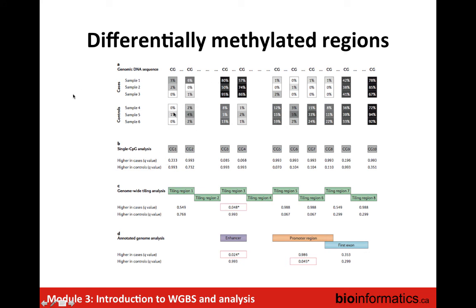So from this, you can definitely do single CpG analysis to identify positions that are differentially methylated. You can do standard statistical tests to estimate which ones are higher in the cases and get individual p-values associated with individual CpGs in terms of methylation.